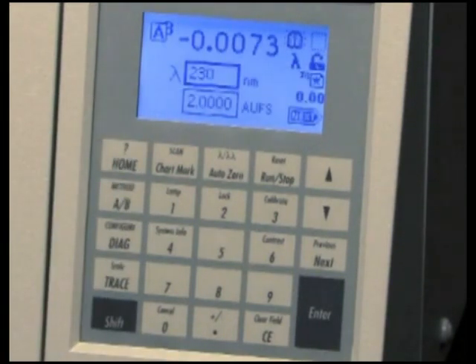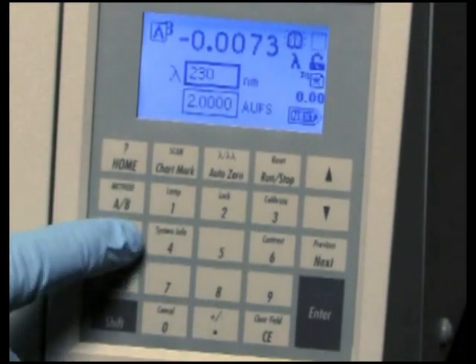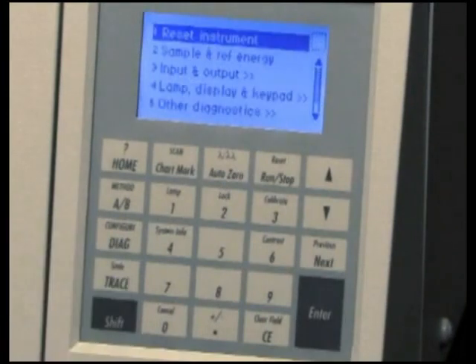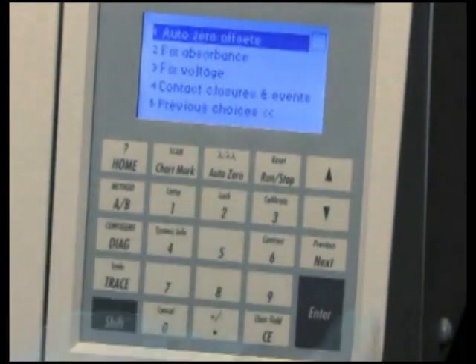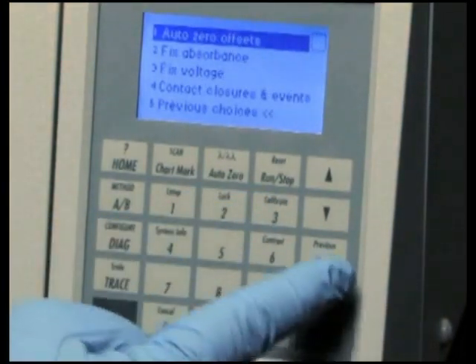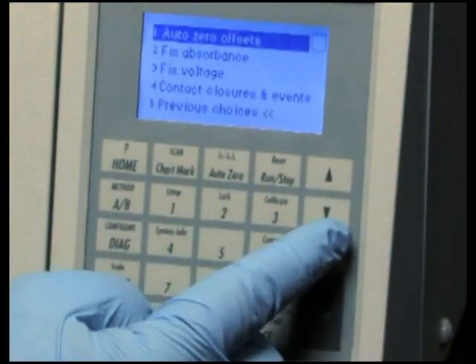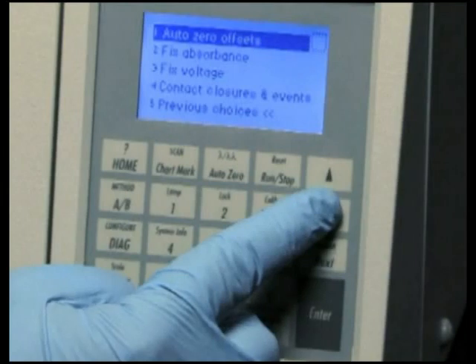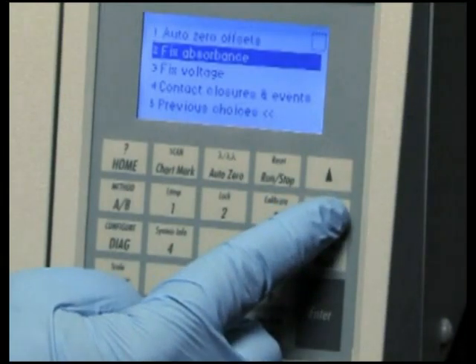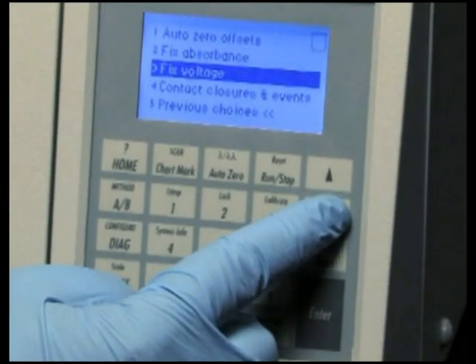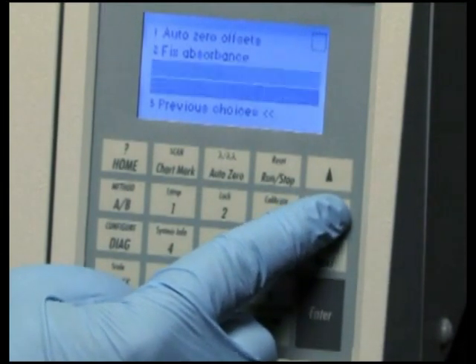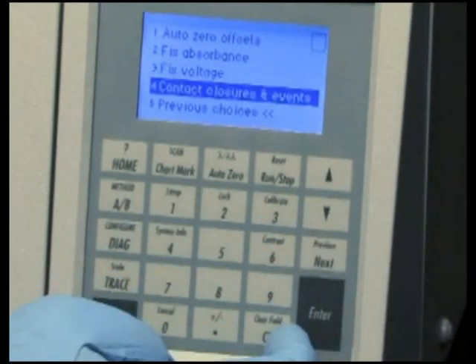Selecting Input and Output accesses a list of diagnostics to control inputs and outputs. They are Auto Zero Offset, Fix Absorbance, Fix Voltage, and Contact Closures and Events.